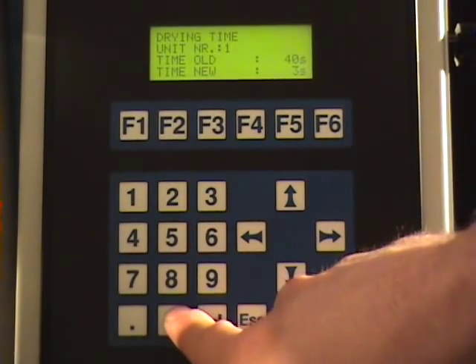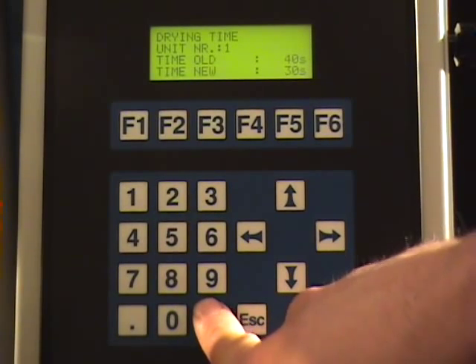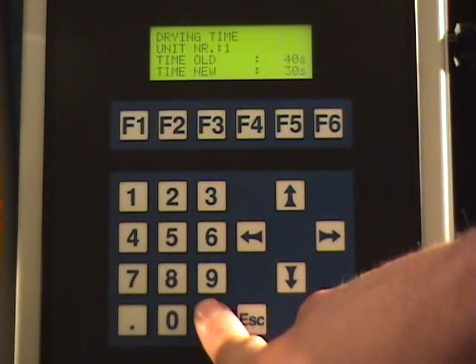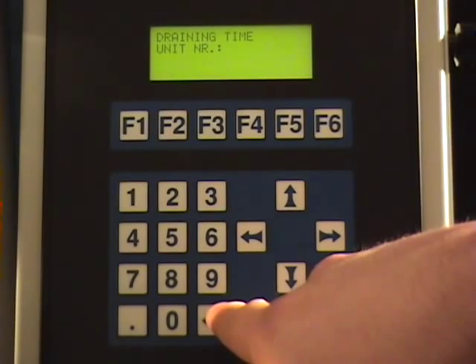Finally, the drying time can be set. This is the amount of time air is pumped through the tube and no solvent is injected, drying the tube and making it ready for the next measurement.